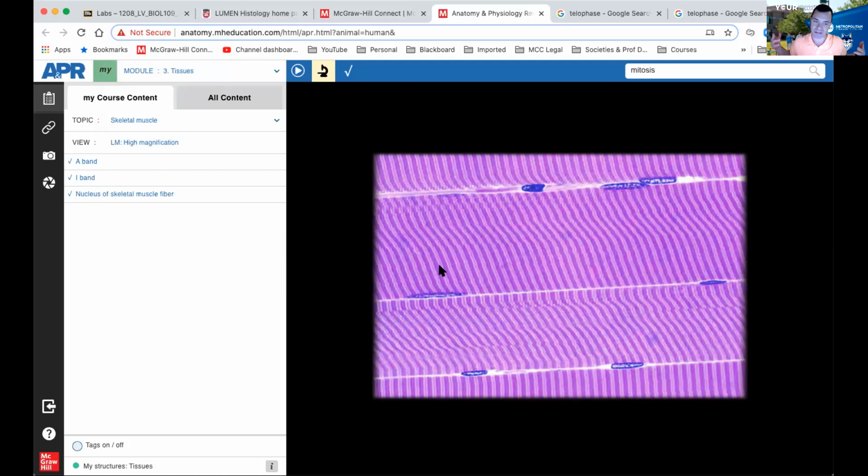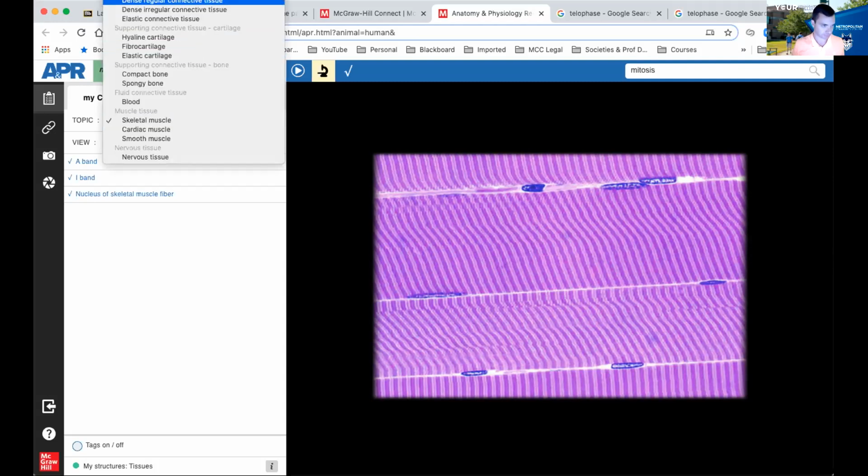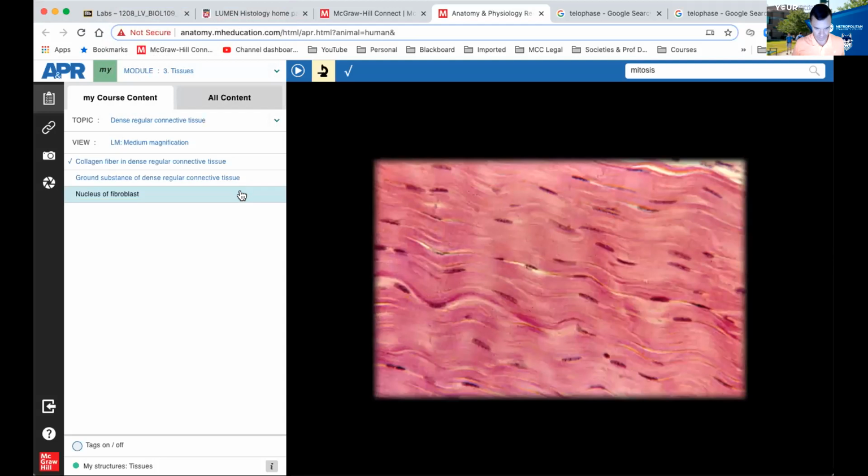On an exam, those get confused, well, not all the time, because there's always 2 or 3 people that get it correct. But a lot of people really screw those two up. They flip-flop them, okay? And here, you can really see this alternating light and dark band. So that's what you've got to really make sure you see, that alternating light and dark band, because I don't see that here.